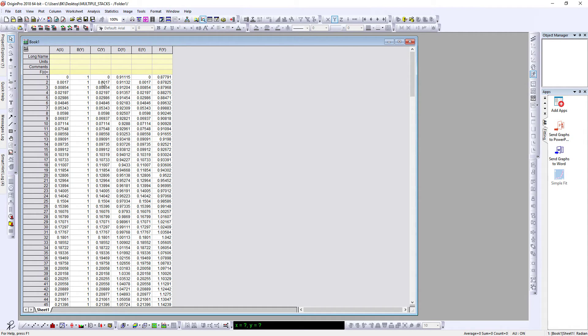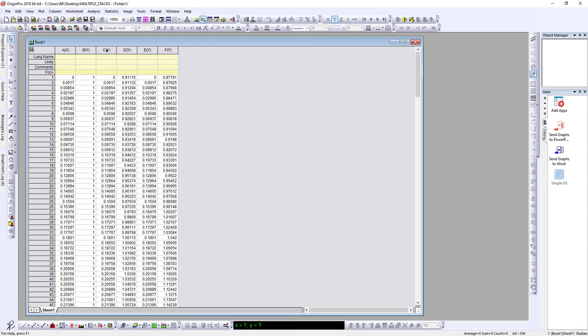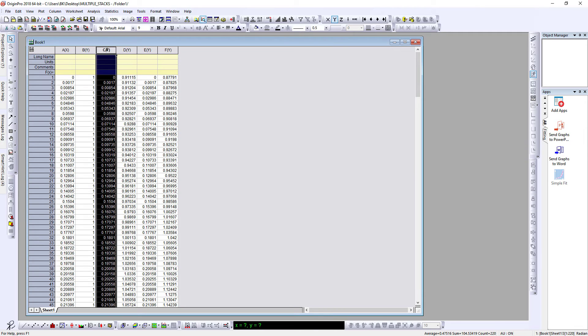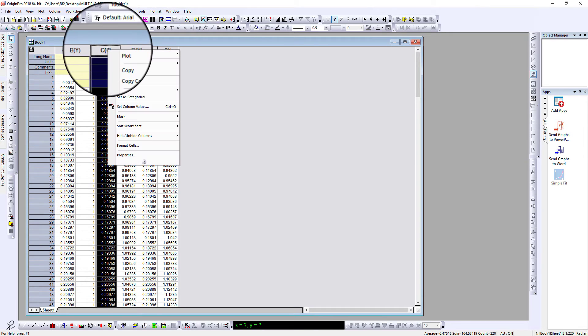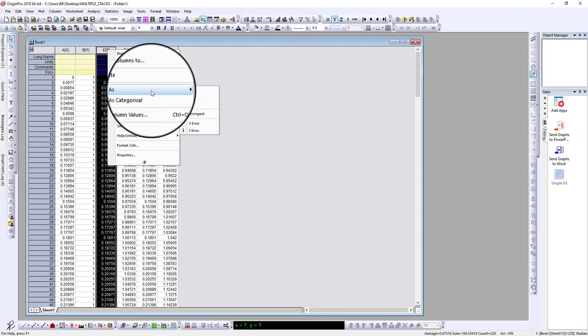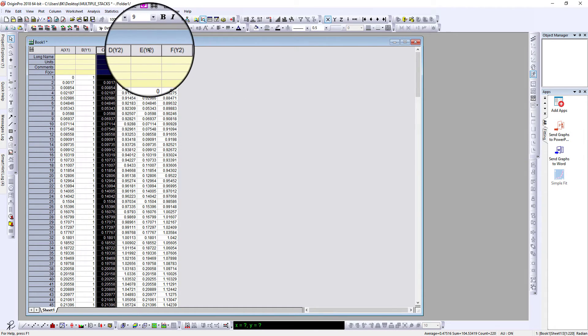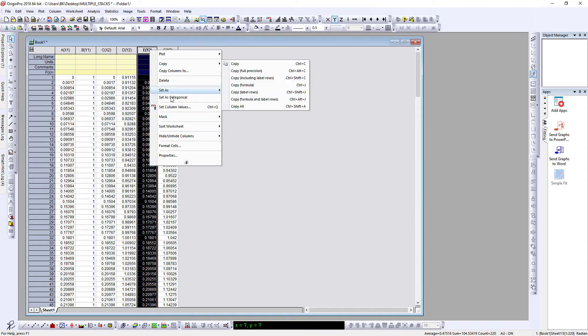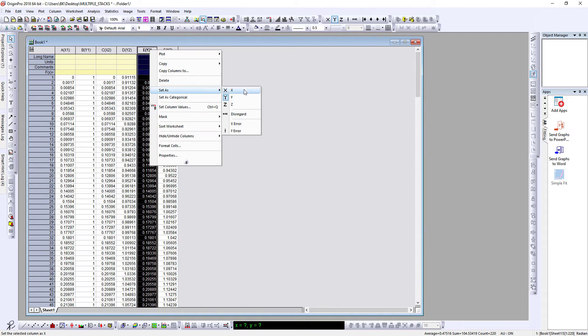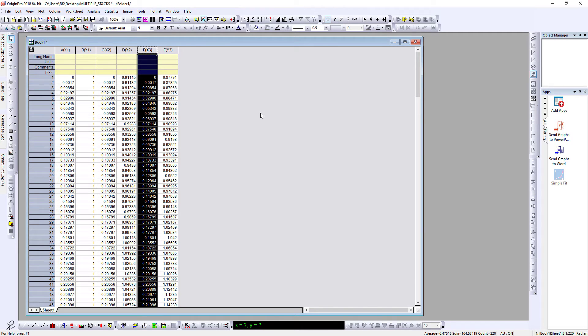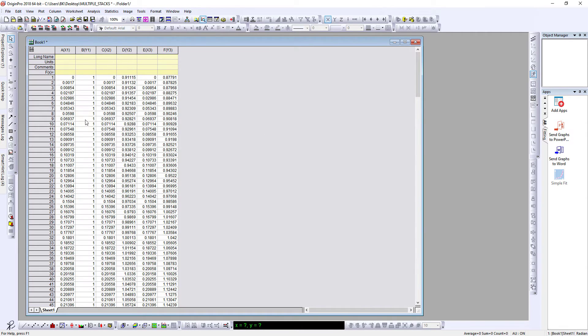Note that these are X-Y data, but by default you will have one X and all are Y. To change it, just click and right click, click on set as X. Similarly, this, right click, set as X. This is how you change your axes in Origin.